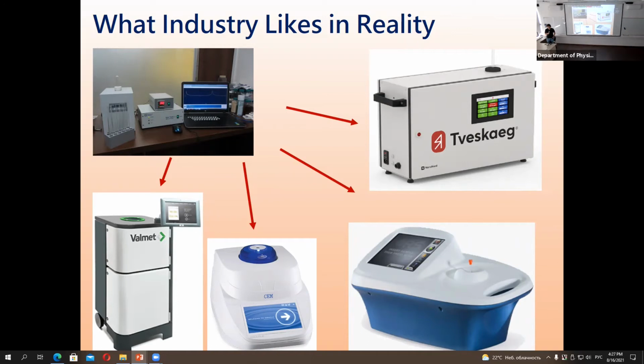For some other systems that requires you to have very good shielding, like legally. It used to be many years ago, but now all this communication and GPS and mobile stations, they are in the gigahertz range. We are talking about megahertz. We are talking about tens of megahertz. That's why there is nearly nothing.